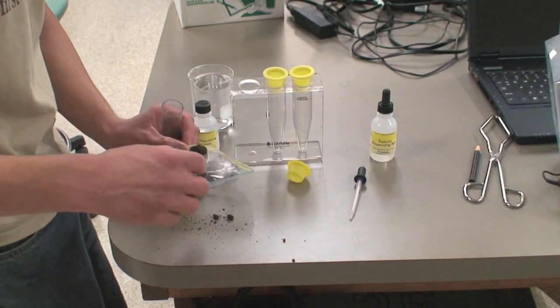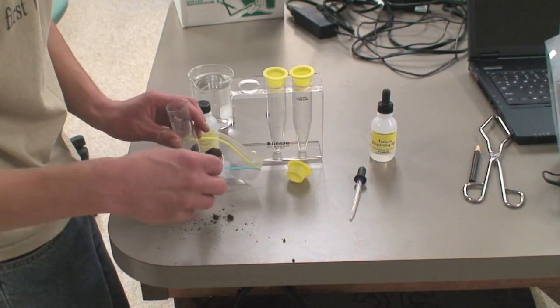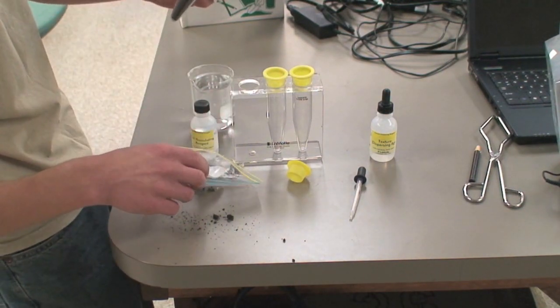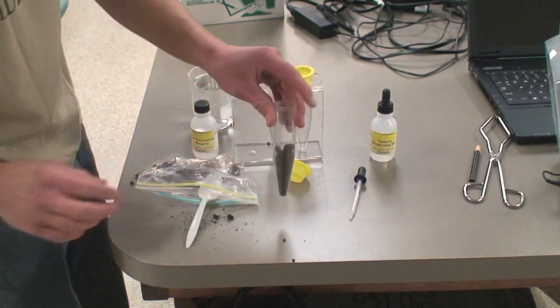First, fill one of the tubes up to the 15 milliliter line with some of your soil sample. Tap the tube to get rid of air spaces, and afterward make sure you still have the correct amount of soil in the tube.